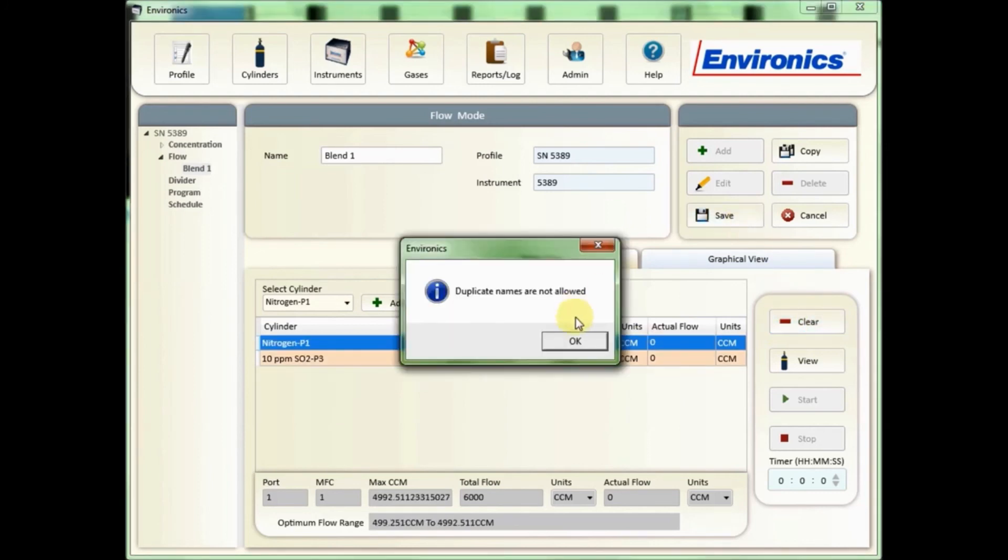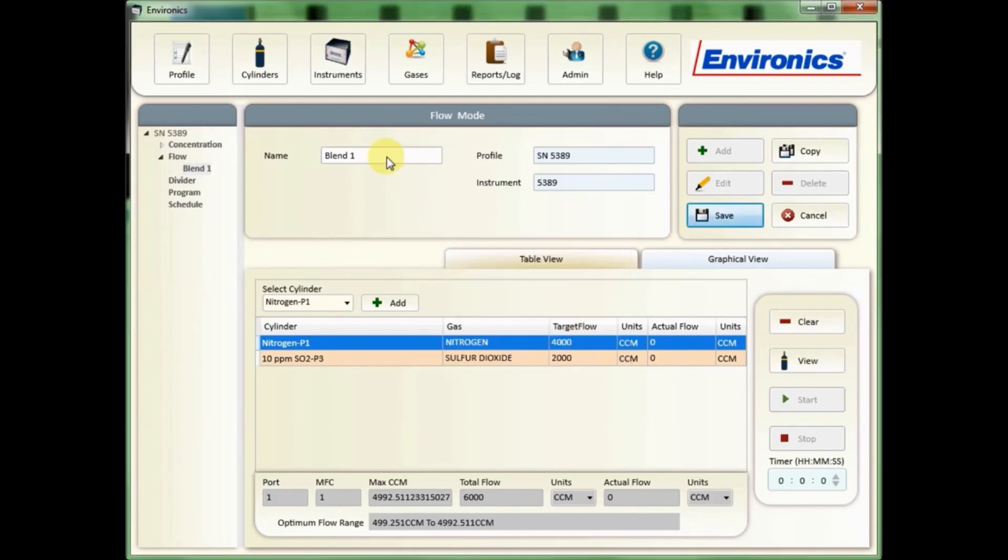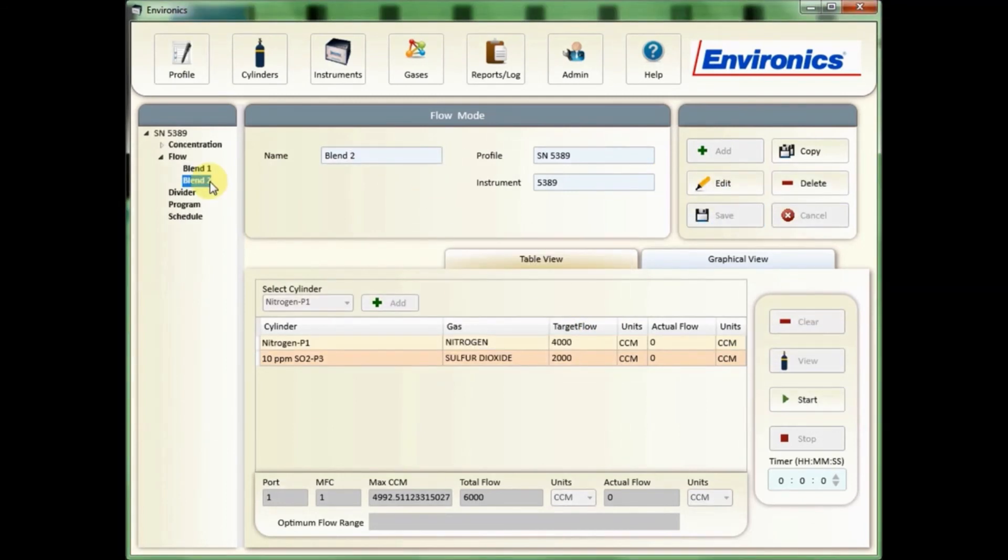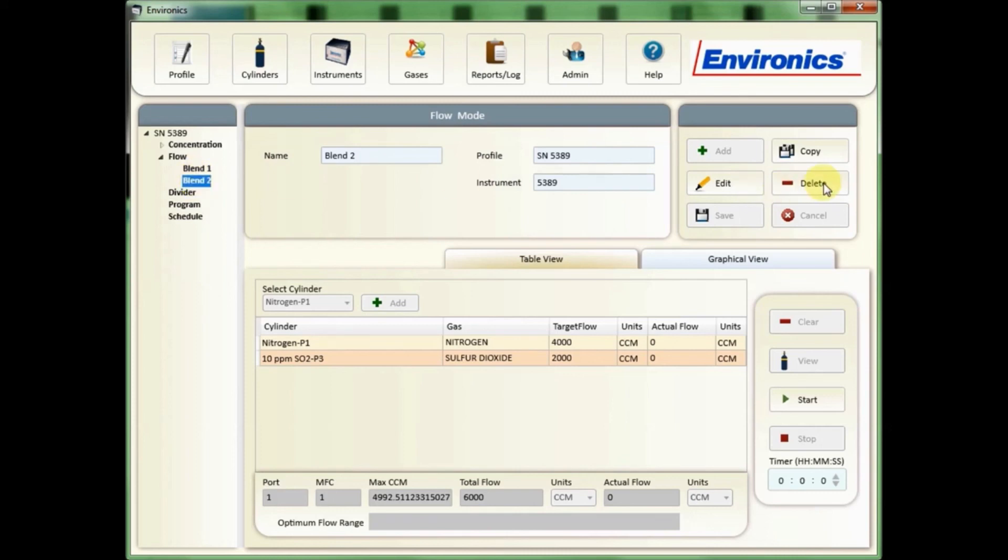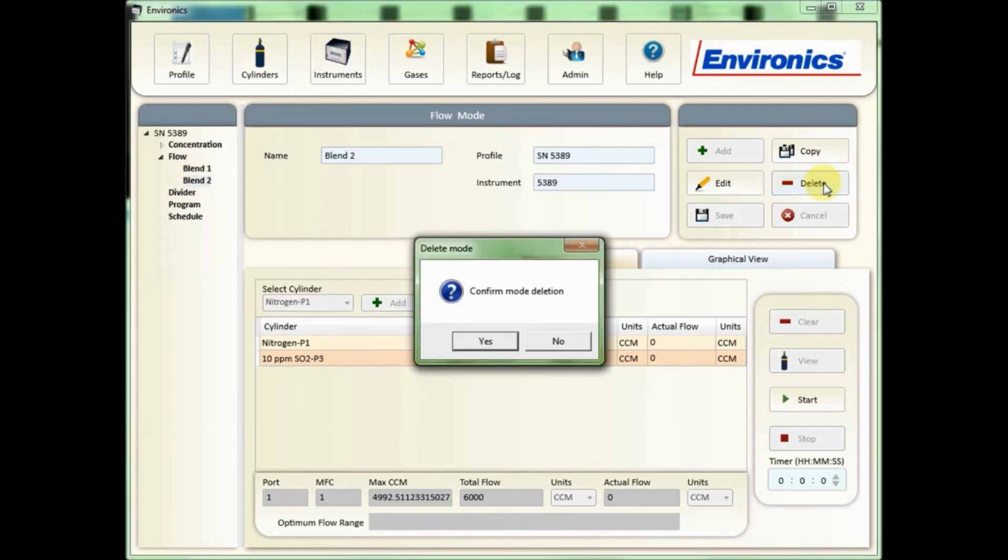The last button here on the top would be the delete button. Select the flow mode that you want to delete, click delete, and then just confirm that you want to delete that particular mode.